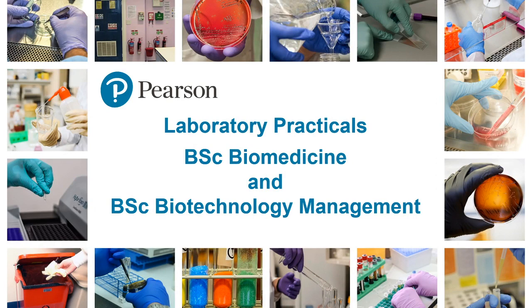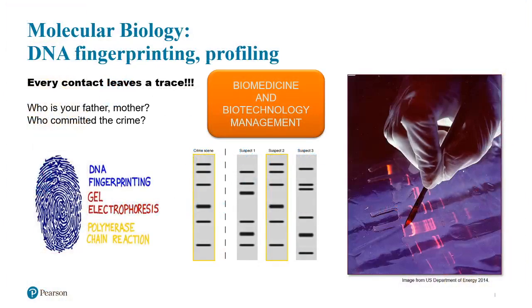Welcome to this sneak peek into some lab experiments performed by students in modules offered in the degrees of BSc Biomed and BSc Biotechnology Management at Pearson. We start with molecular biology.